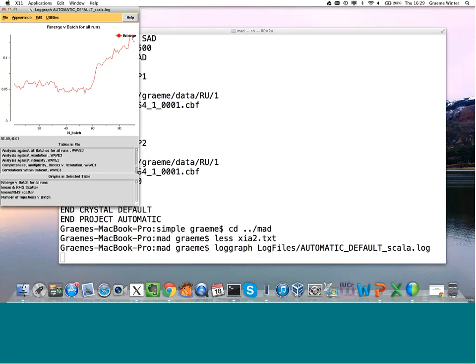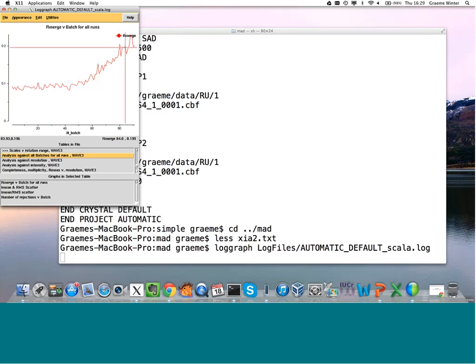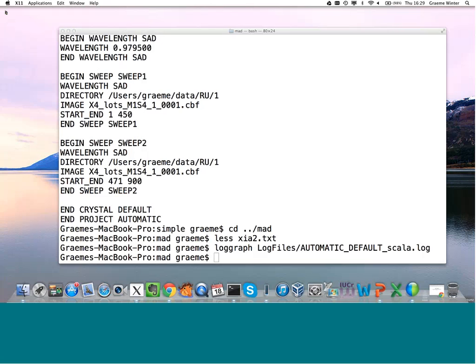If we look at the peak wavelength, which has disappeared for a moment, there we go, it actually starts at about 10% and increases horribly from there. So recalling this was measured afterwards, it's probably sensible to consider chopping off the dataset after the 60 degrees on the first and second wavelength.